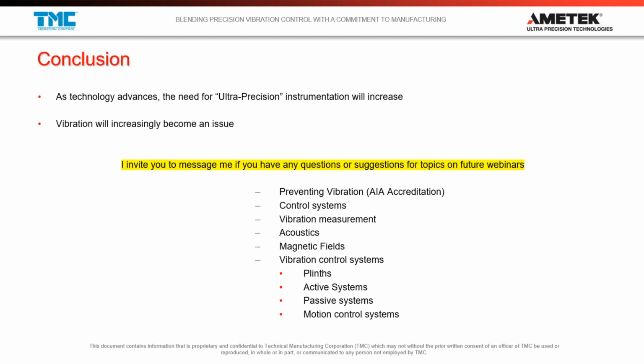So the best way to figure out where your problem's coming from is to take a measurement of the floor and a measurement of your surface, and try to point out what exists on the surface that might not exist on the floor. You might be able to identify some system resonances that way. So it's a complicated problem to solve and identify what's causing your issue. I don't know enough about optical microscope construction itself to say definitively whether it's acoustics or floor vibration. I think each system's going to have its own frame, its own resonances, and its own sort of weaknesses.